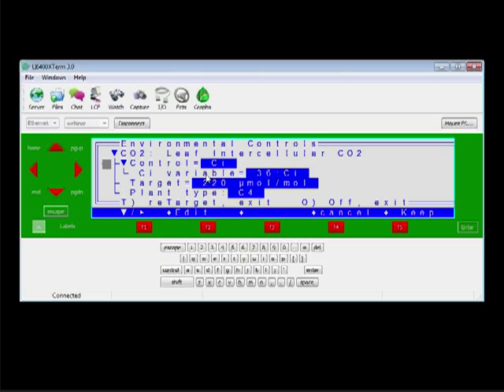and then I can specify what I want the CI variable to be. It would make sense in most cases for me to consider the CI variable to be CI, but if for some reason I wanted to change that variable and use a separate variable, perhaps a variable I created so I could do my own calculations, the software would let me do that.